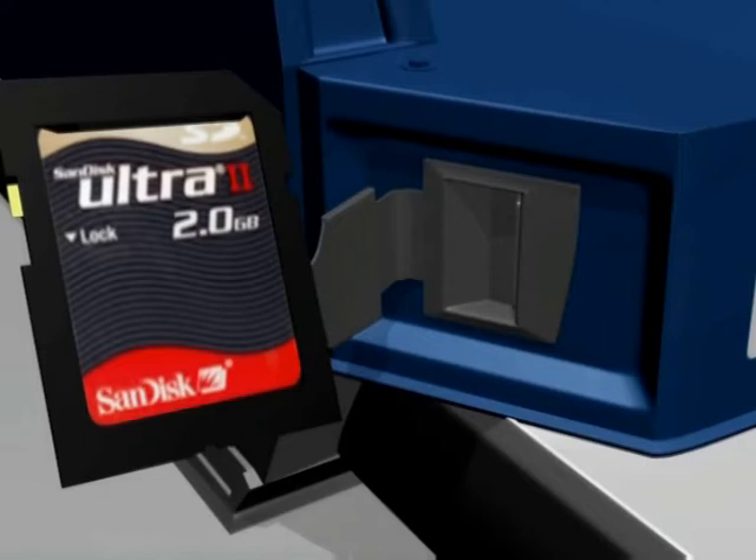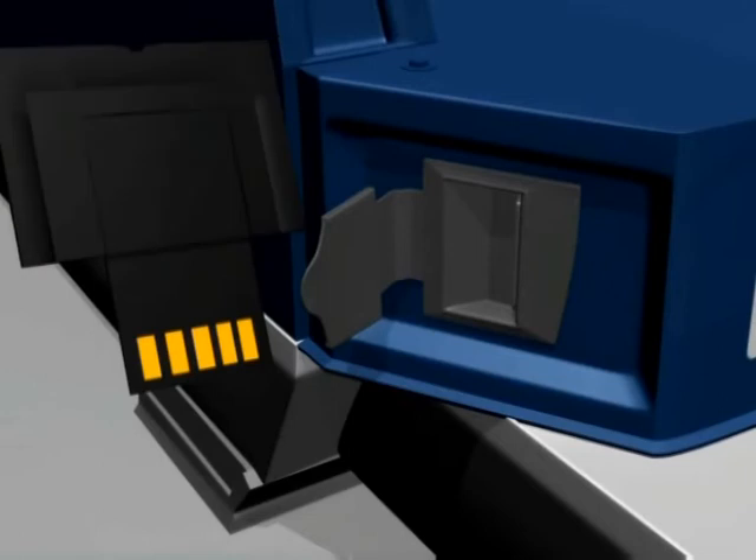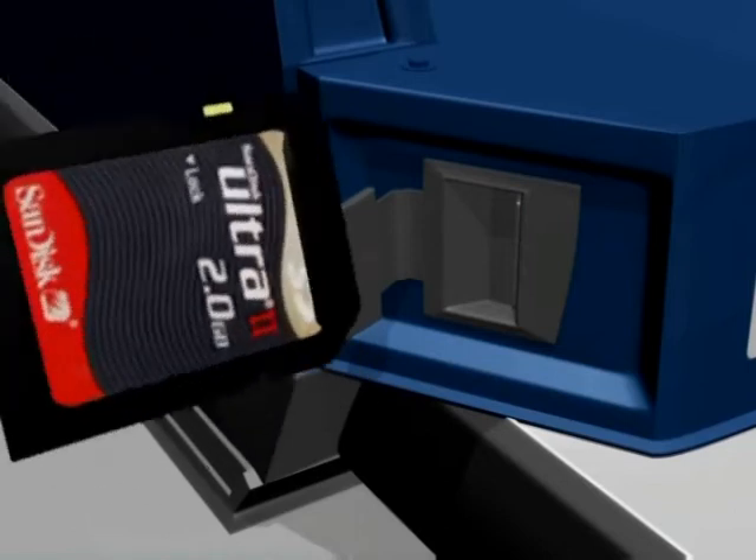The SD cards can also be folded in half. When folded, a small connector is visible, which allows the card to be plugged into a USB slot on a computer.